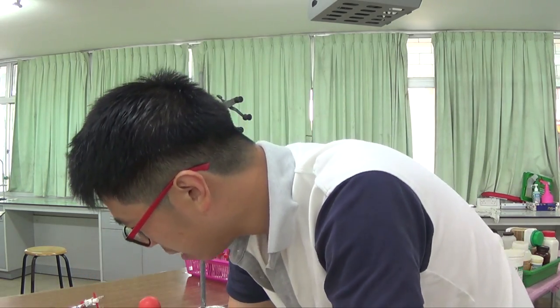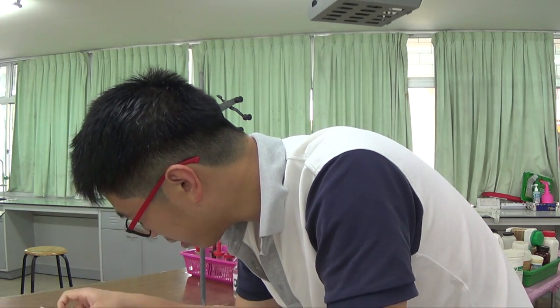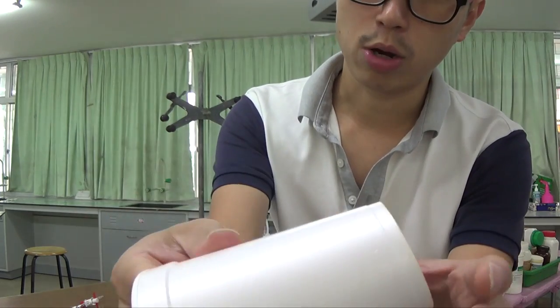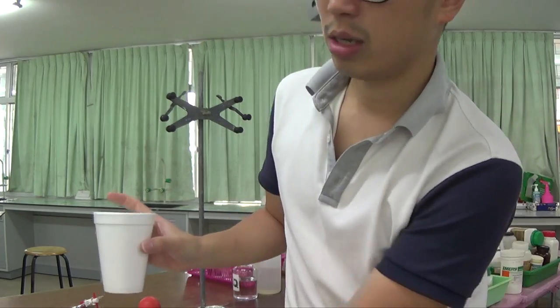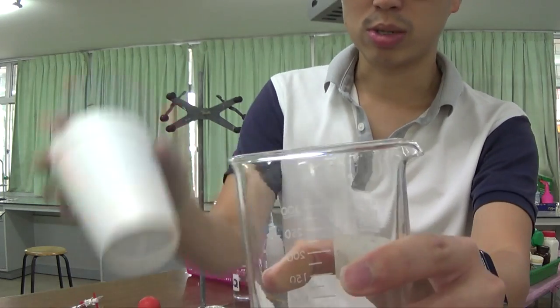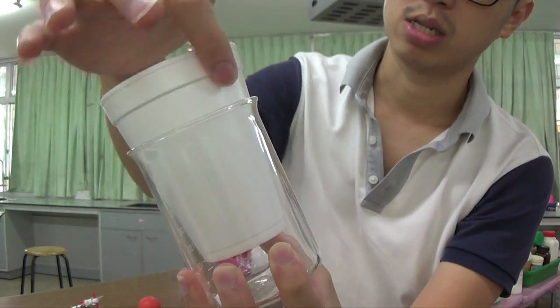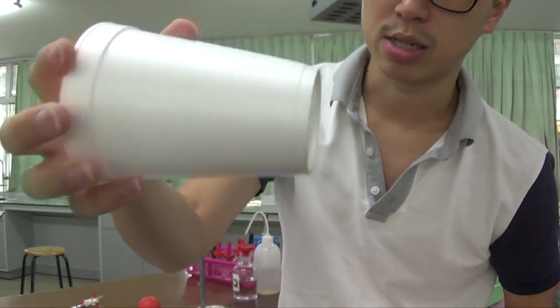Okay, so P is sodium hydroxide in a plastic cup. So I have a plastic cup, but this is what you call styrofoam, or polystyrene cup. So the styrofoam or polystyrene cup is going to be very light, okay? So what we do is we support it on a beaker like this. And this is a way in calorimetry of us to reduce heat loss, because this is a polystyrene cup. It's actually a poor conductor of heat.